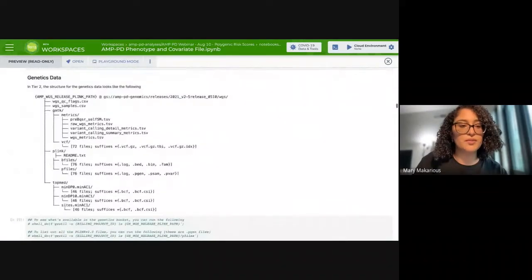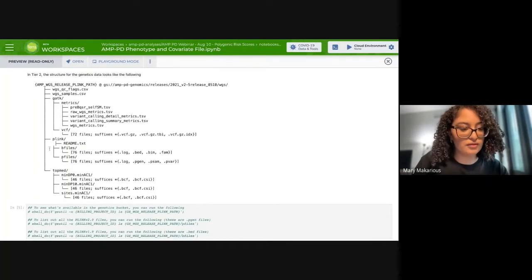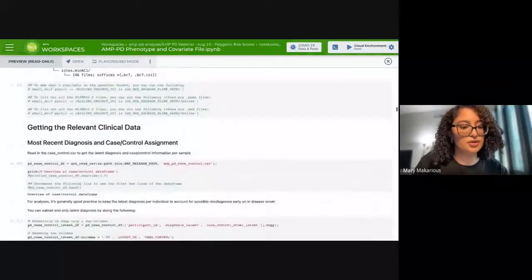What AMP-PD also makes available, and if you've been coming to these webinars for a while, you'll have noticed that there's a wealth of transcriptomics and proteomics data as well. Because we are calculating PRS, I wanted to showcase the amount of genetics information AMP-PD makes available. AMP-PD makes whole genome sequences available, which is an incredible resource, and you won't be able to find that most places. Specifically for our next notebook, we'll be focusing on these Plink files. We'll talk about that in the next notebook.